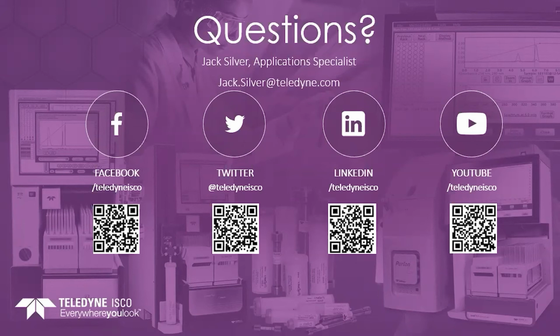Okay, I see we have our first question, and it's asking, is there baseline correction? The answer to that is a little longer than you might expect. We don't measure the baseline and correct for it as we do on the NextGen 300. The NextGen 300 has a separate flow path where we can measure the solvent absorbance without running the solvent through the column. However, on the ACCQPrep, on the all wavelength correction, what you can do is set the peak width setting. And the peak width setting here does double duty.